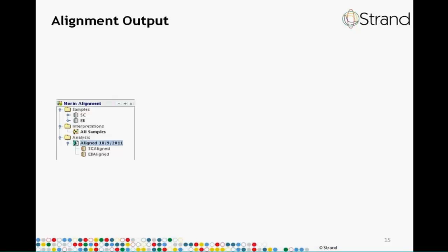After that, the alignment is carried out and the navigator shows the result of the alignment process. You can inspect the reads in the Genome Browser, you can do post-alignment QC, and if you want, you can rerun alignment any number of times. And once you're happy with the results of alignment, you can directly create a small RNA analysis experiment from the results of the alignment.